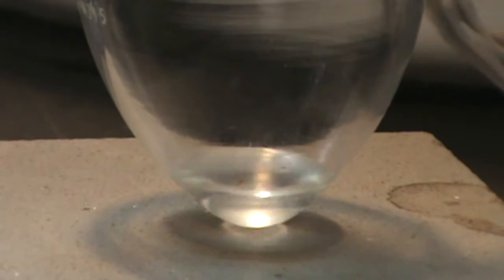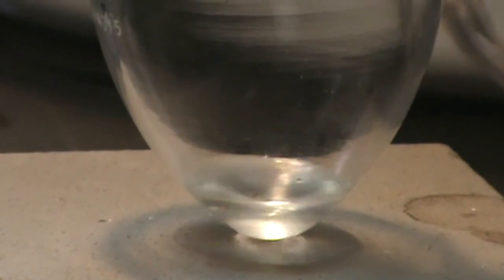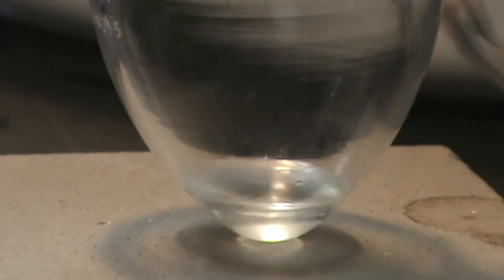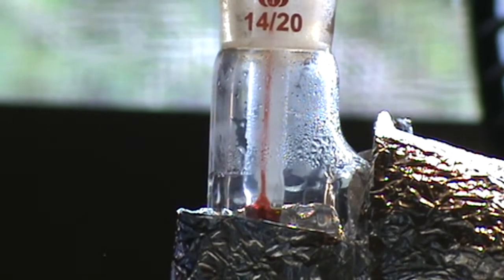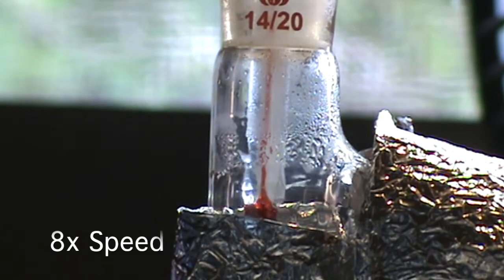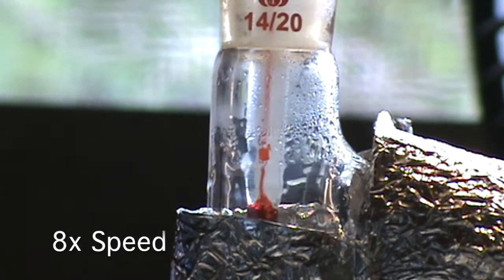The boiling flask and still head must be wrapped in aluminum foil so that it reaches the needed temperature. Here's the rest of the distillation footage sped up to eight times.